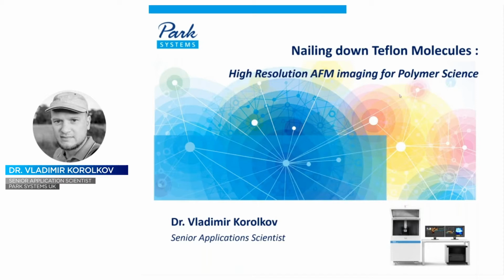So in this webinar, we're going to talk about how you can use atomic force microscopy for structural studies of polymers. Specifically, we can look at how we can obtain real space and high-resolution images revealing single molecules and how that could help you in understanding the structure of polymers.